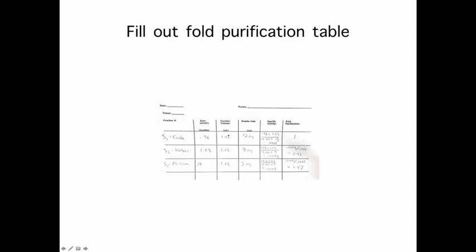And let's say it took 20 microliters of protein to be able to do that. Now, this is variable. I have 1.02 for all these, but this number will likely be different for you. I just did this to show you the math. So let's say it was in 20 microliters. So your total volume with your 1 ml cuvette volume of the specific assay mix itself plus 20 of the protein.